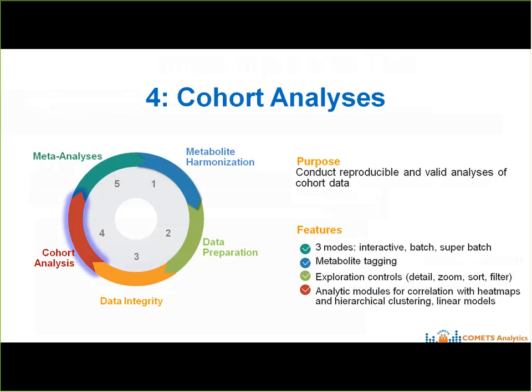You can specify your models interactively, where you can specify what variables you want to look at using point and click; batch mode, where you can use the pre-specified models in the Excel sheets to look at what the results are; or the super batch, which is the one that we'll be using for most analysis, where you submit the job to a server and you will get the results in your email.